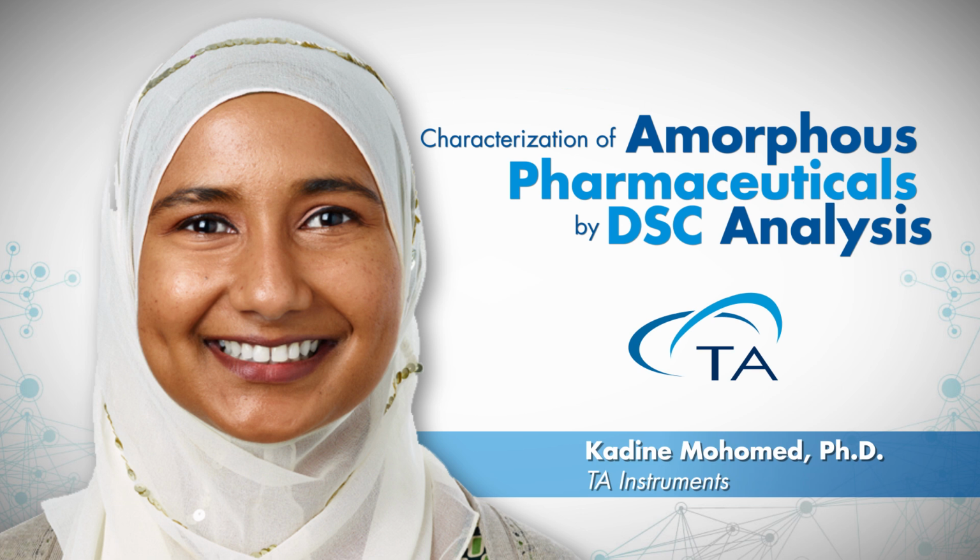So if the amorphous components in your blend, if you have multiple components, if any of them are miscible with each other, then the glass transition will follow the Fox-Flory equation. The Fox-Flory equation states that the glass transition of the blend is equal to the weight fraction of component 1, or amorphous solid 1, multiplied by the Tg of that amorphous solid, plus the weight fraction of the second component multiplied by the glass transition of that second component.